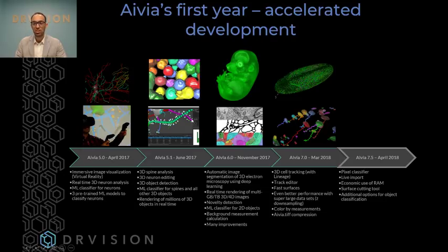We then expanded on both of those, that's why it's 5.1. We added more functionality to the neuron tracer and more options to the object classifier so that it can classify more types of objects into the end 3D. And also, we added a new recipe to detect 3D objects that aren't neurons, so blob-like structures.